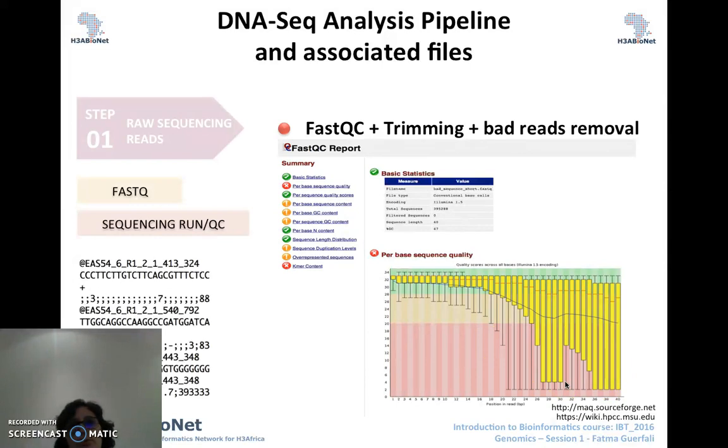Or we could also improve it by removing bad quality reads if they are in negligible proportion. The trimming at this stage would make sense because the reads are of poor quality, and this is especially true for de novo sequencing, so be careful if you are doing de novo sequencing, because for this kind of sequencing, the genome assemblies can really be improved by data cleanup.